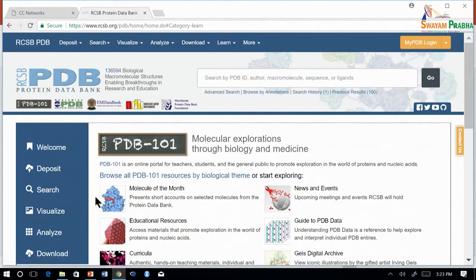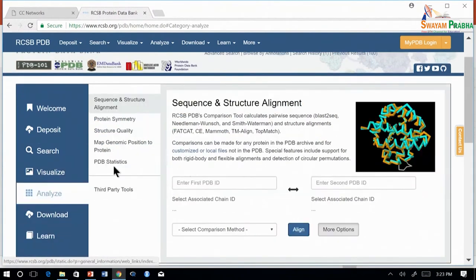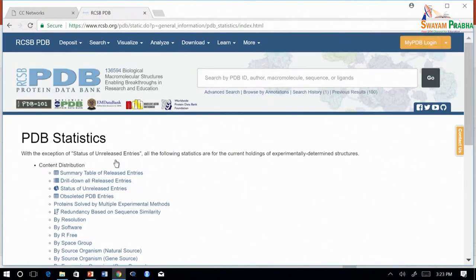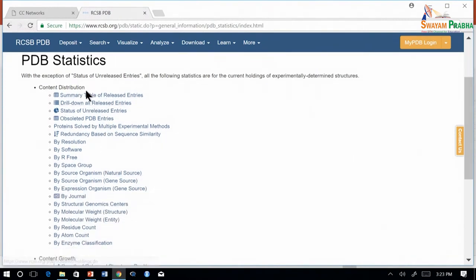Now we will see the statistics of PDB database. These can be found here. The statistics are grouped under two sections: content distribution and content growth. Content distribution contains statistics on the data currently deposited in PDB.